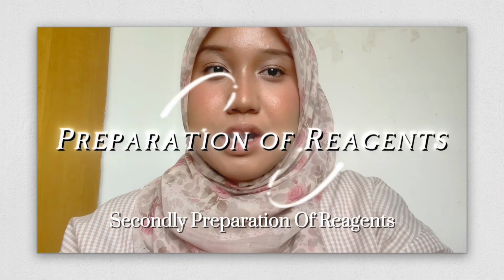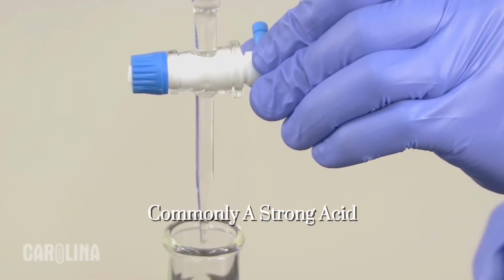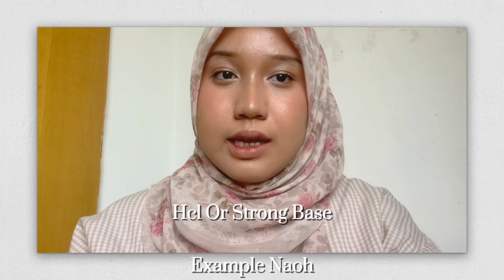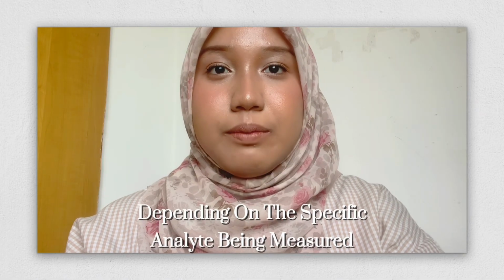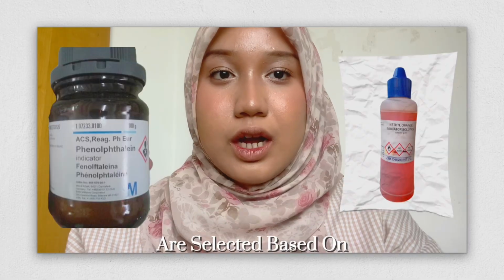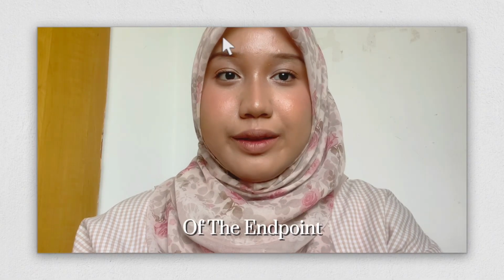Secondly, preparation of reagents. A standard titration solution is prepared, commonly a strong acid, for example HCl, or a strong base, for example NaOH, depending on the specific analyte being measured. Indicators like phenolphthalein or methyl orange are selected based on the expected pH range of the endpoint.